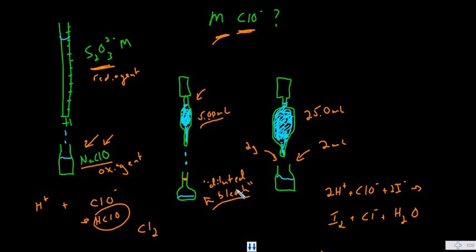We're then going to take that diluted bleach solution, add it to an Erlenmeyer flask, and then add 2 grams of potassium iodide. And then in the fume hood, we're going to add 2 milliliters of 3 molar hydrochloric acid. We must do this in the fume hood because it does release a little bit of chlorine at that time. Fortunately, the reaction with the acid should occur quickly, though.